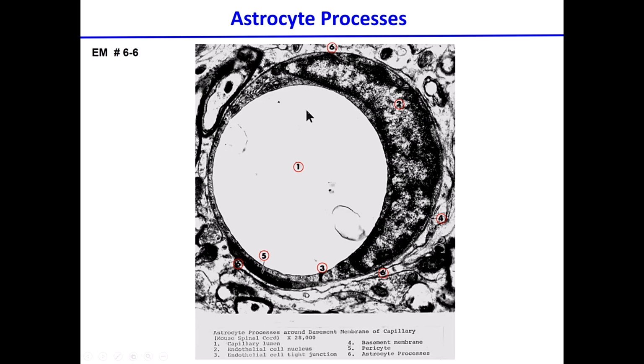This is an astrocyte. Basically, it is an astrocyte that is going to be wrapping something. That's what astrocytes tend to do. What this one is wrapping is a blood vessel, right? So this is the lumen of the blood vessel. Of course, you guys know that the blood vessels are formed by endothelial cells, and that's something that by now you have studied, or you haven't studied that yet. You haven't studied that yet, so you probably know more about that than I do.